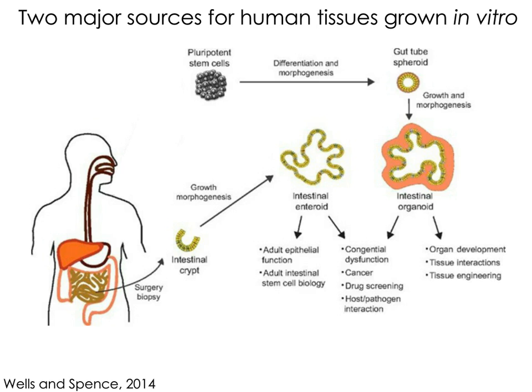So for example, in the schematic, it's showing the intestinal epithelium, a crypt, which houses the stem cells in the intestine, can be taken out from a patient through a biopsy, for example, and can then be grown in culture. And so for the purposes of today's seminar, this webinar, I'm really going to talk about pluripotent stem cell derived tissues that we generate in vitro and then utilize for our experiments.